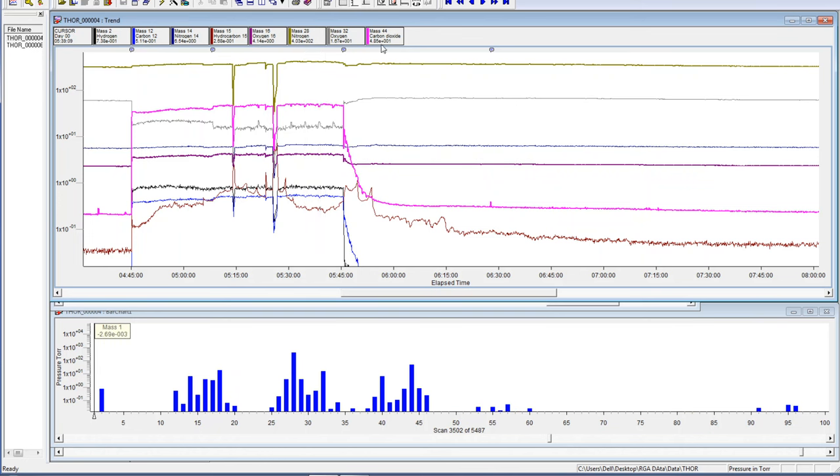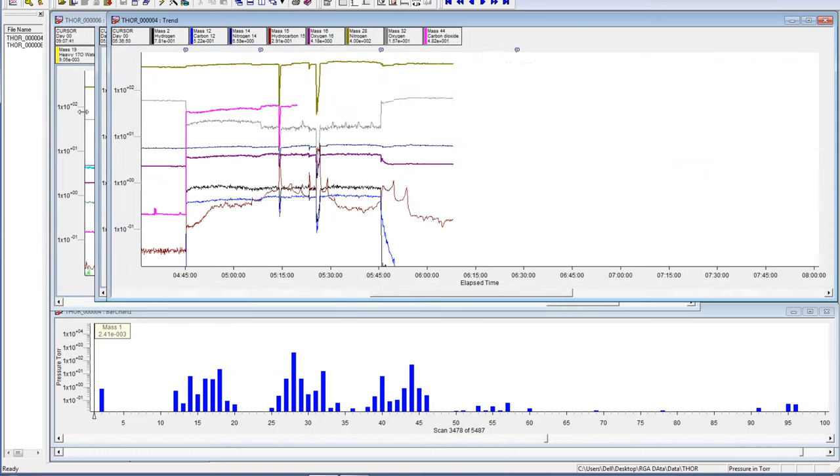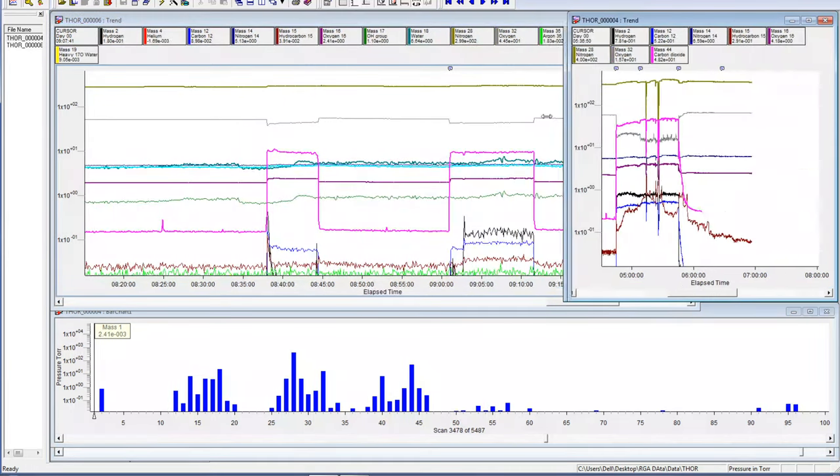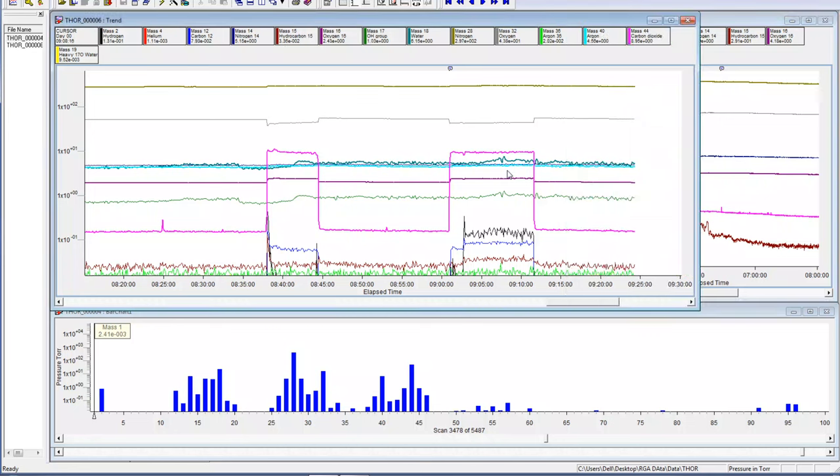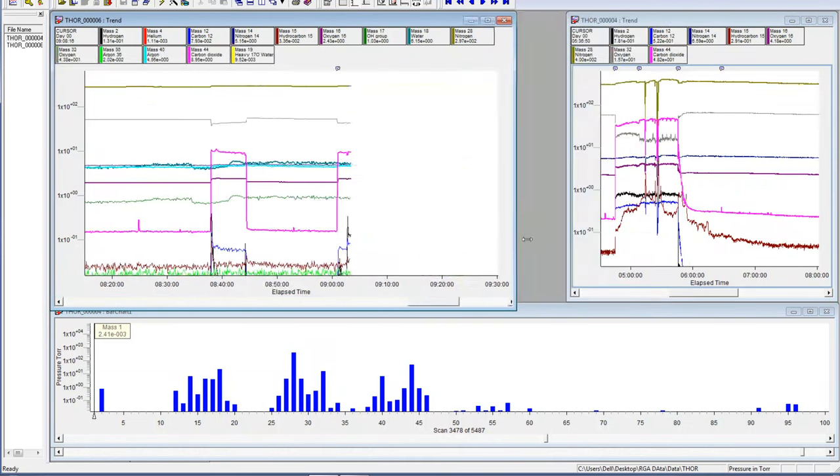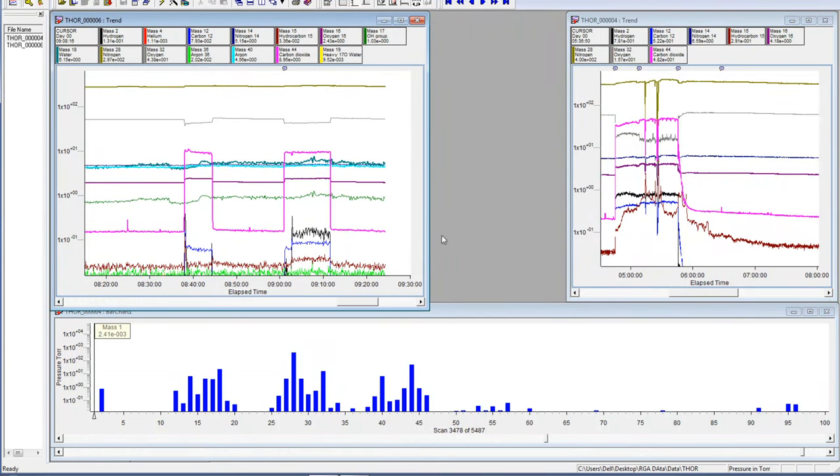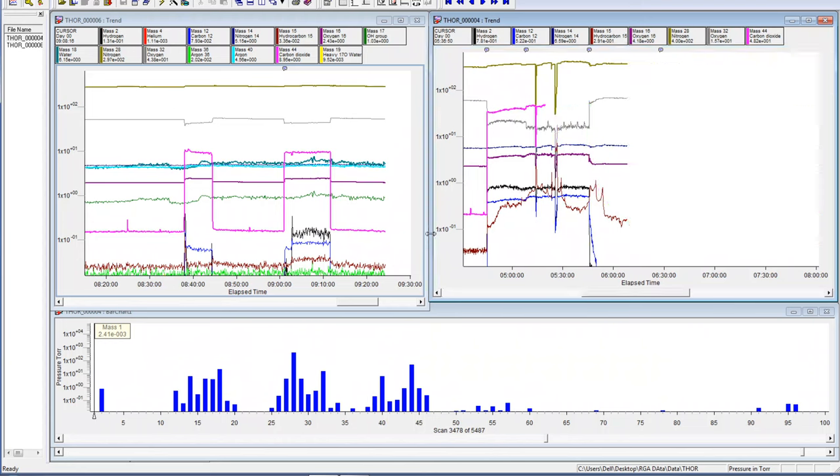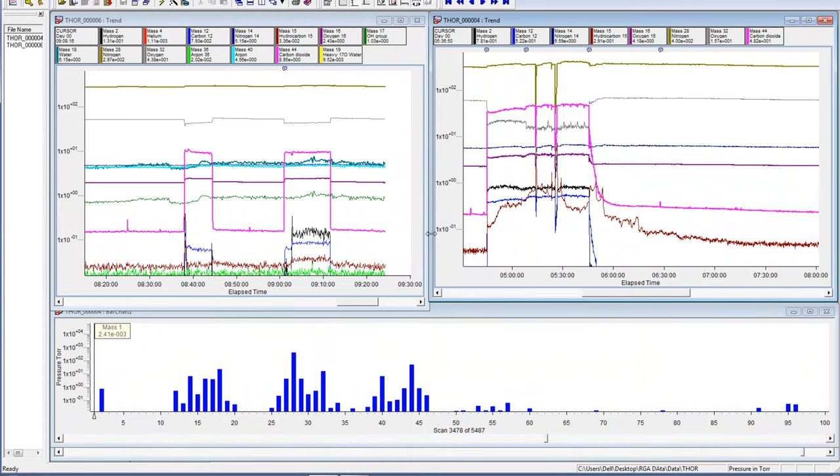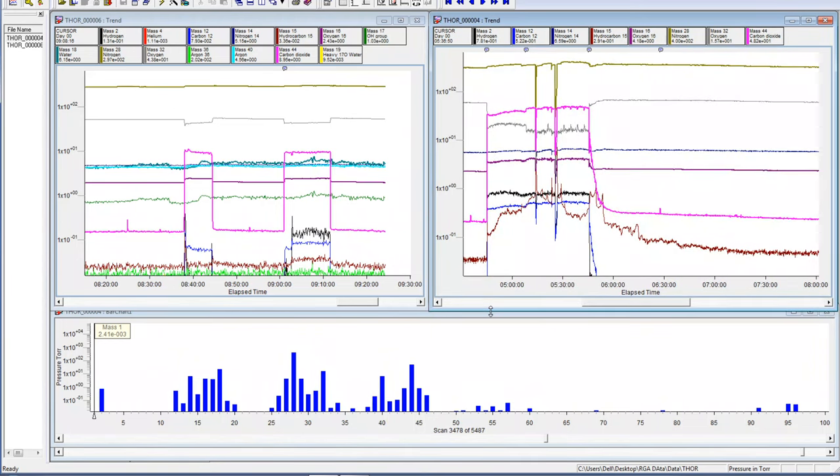It is quite significantly larger. The oxygen is 1.67 to the plus one, so that's actually down. Let's compare these two.